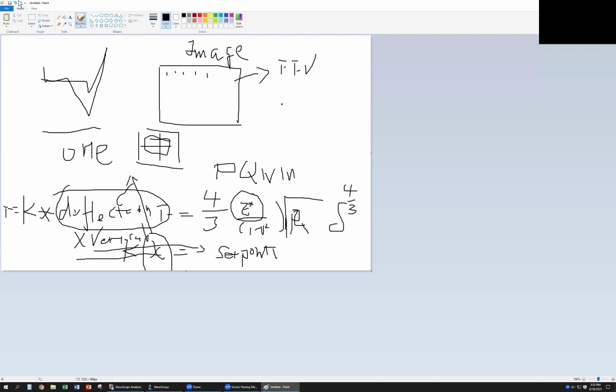This is this sample. You can see inside this box there are four samples here. The modulus of these samples is already known. They give the modulus. So that's why we call this one the standard sample.